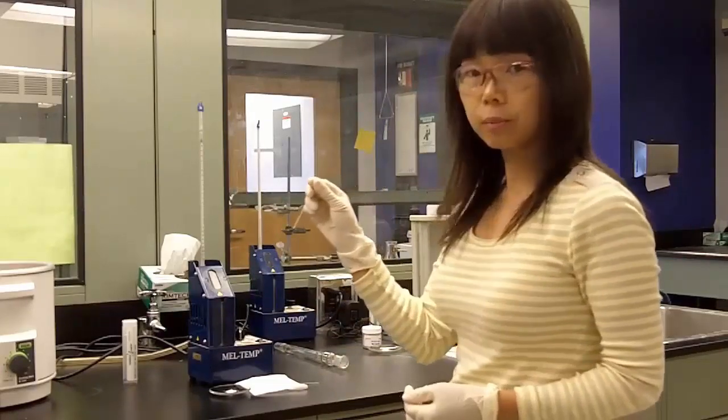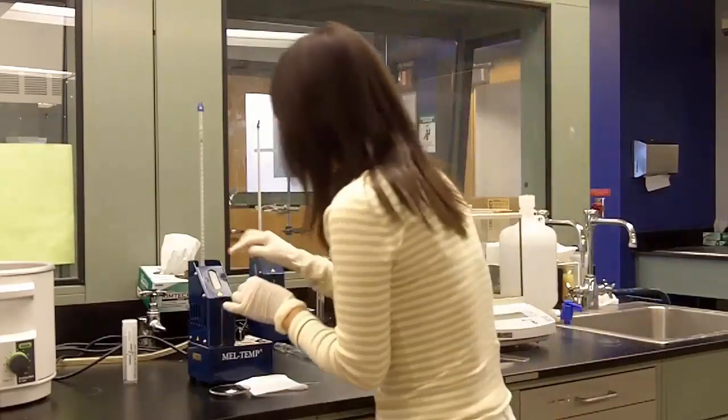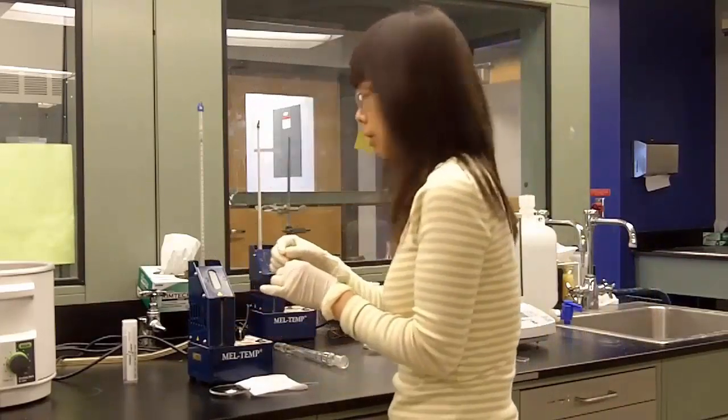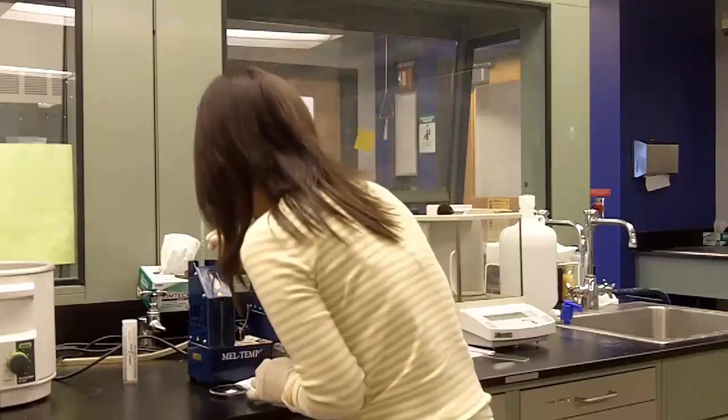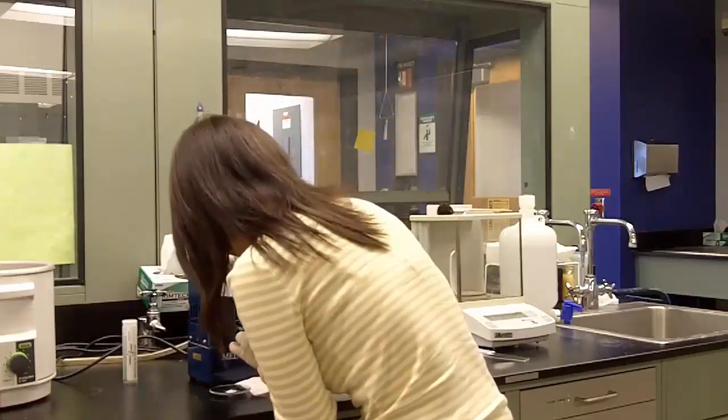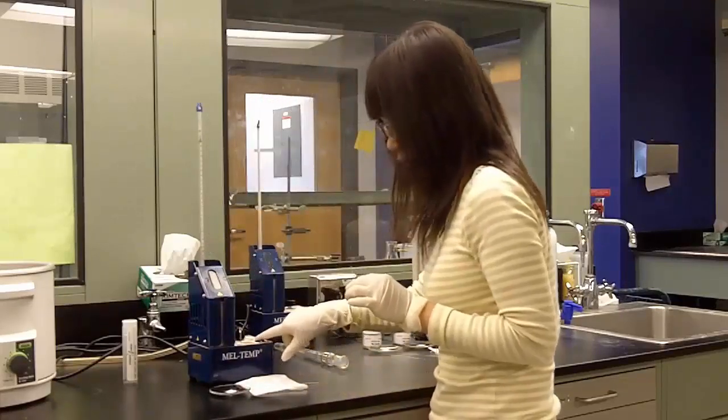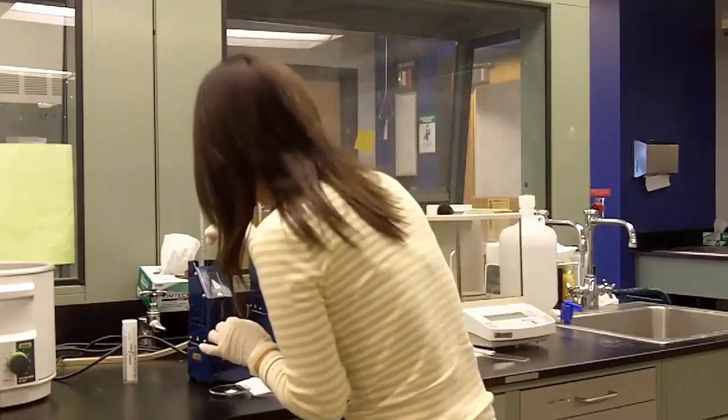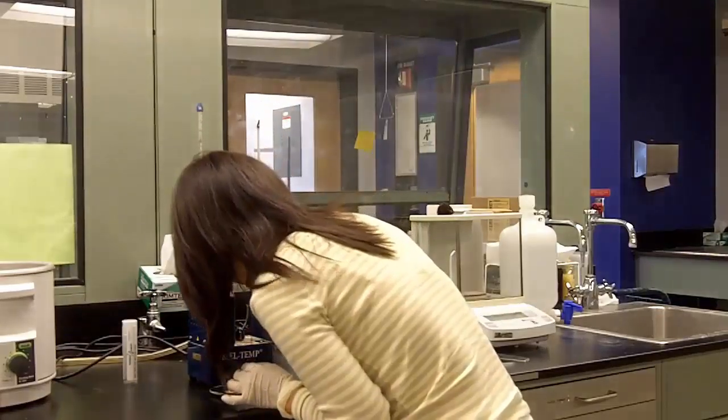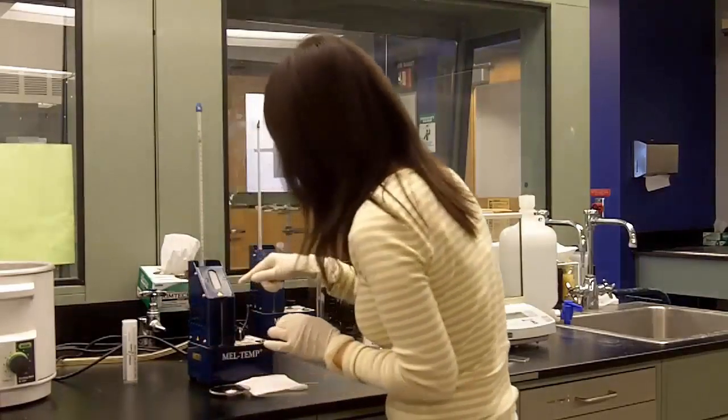We're going to take a rough melting point. There are three slots in the melt temp, and let's put this in the middle slot. To see your sample, make sure you turn the switch on. And then through the lights from underneath the magnifying glass, you can see your sample.